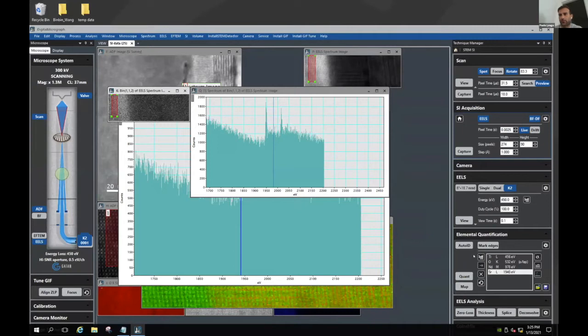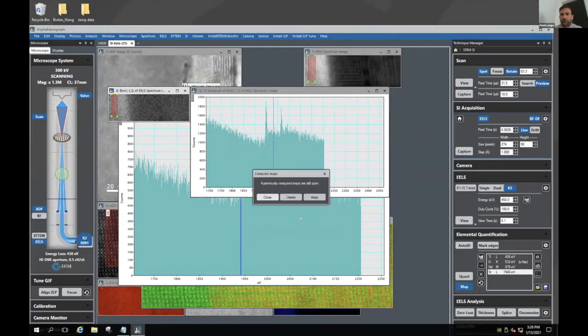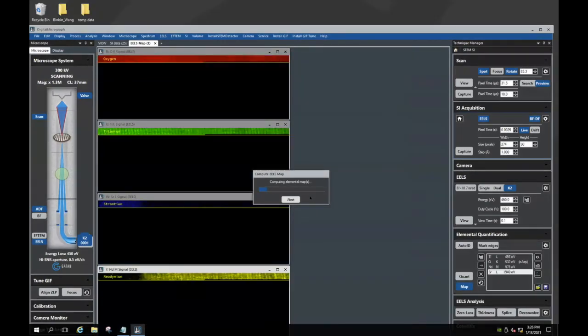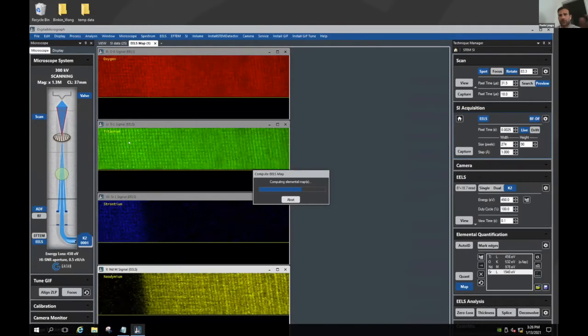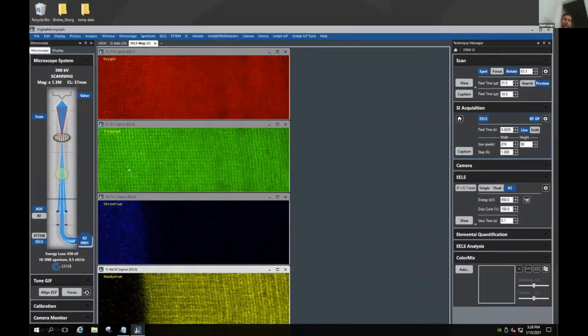So the periodic table works, the elemental font. You just click on this spectrum image, you can say map, and you can even tell it to display on a new workspace. Show them where to click in the bin mode, Paolo. Okay. So now we're getting new maps from the dataset that I was binning. I mean, the titanium looks really nice. And we could go up in magnification, or we can look in a small area and see where these areas are located.